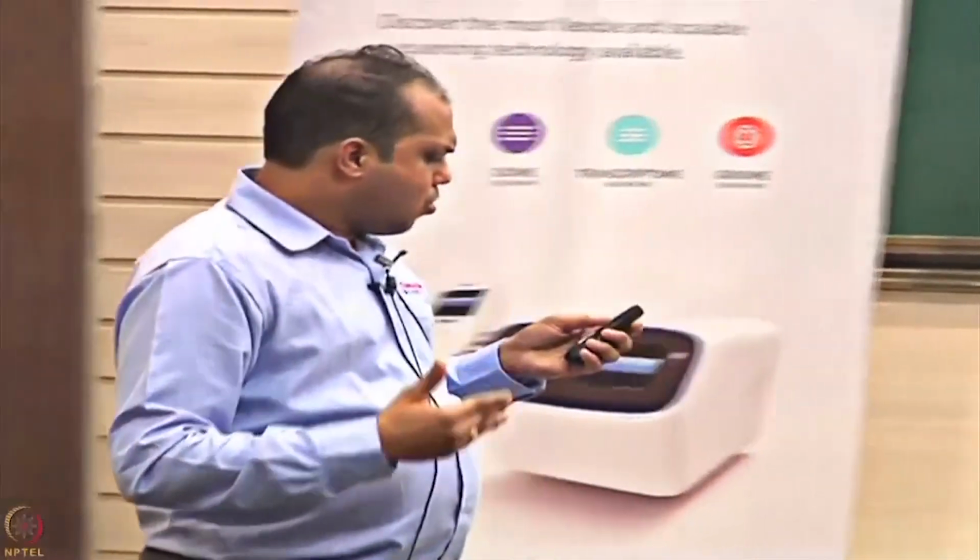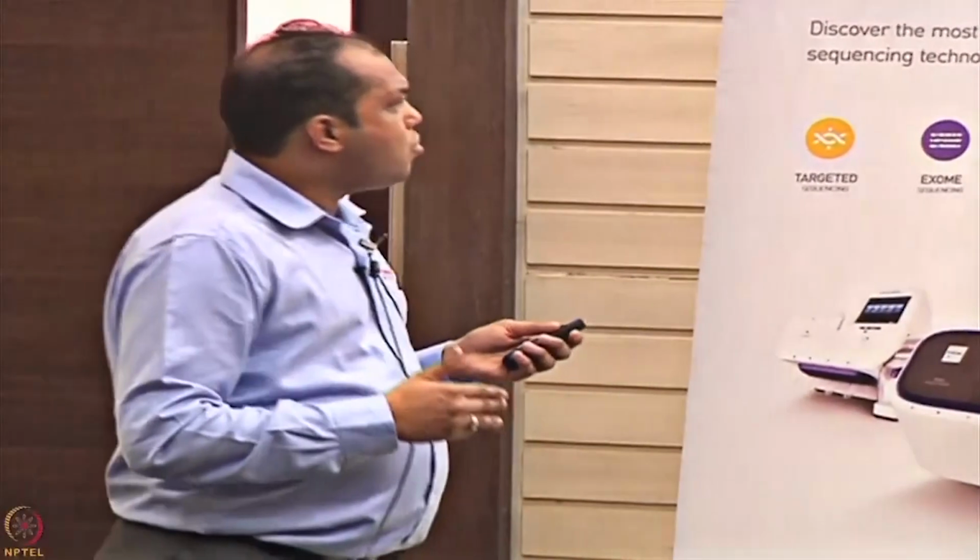So you get sequences which are around 200 base pair, 400 base pair, or it may be on a higher read length of 500 to 600 base pair also, okay? So once you have done sequencing, what should we do further? We have got the raw data, right?